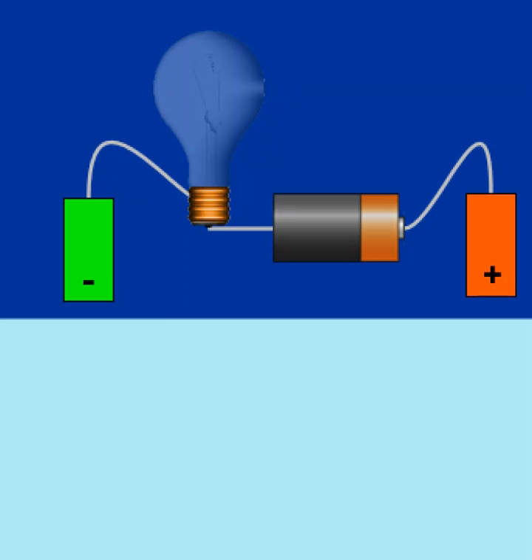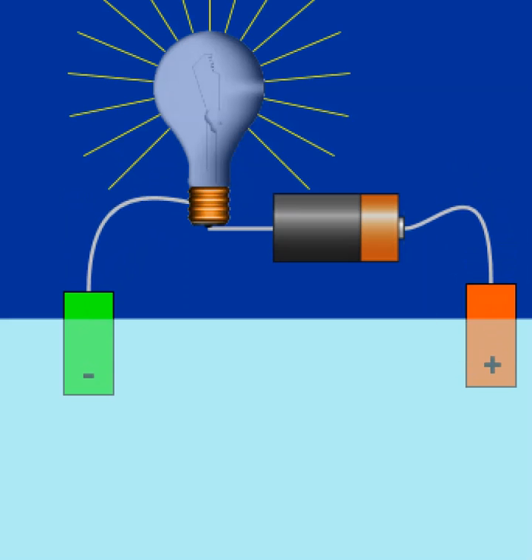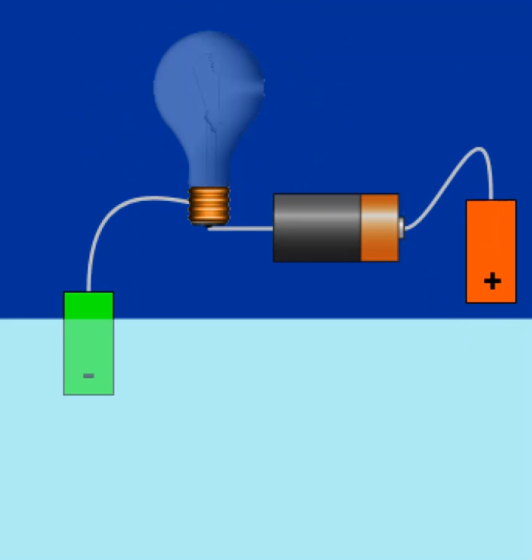Okay, this is my hydrochloric acid. I'm starting with the 1 molar hydrochloric acid, and it's very bright. It'll be about the same as the 1 molar sodium chloride because they have the same number of ions. The type of ion does matter a little bit, but this is very bright. So what do you think will happen if I go to the 0.1 molar instead? Let me get that ready.